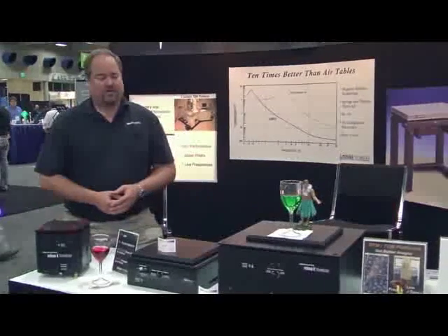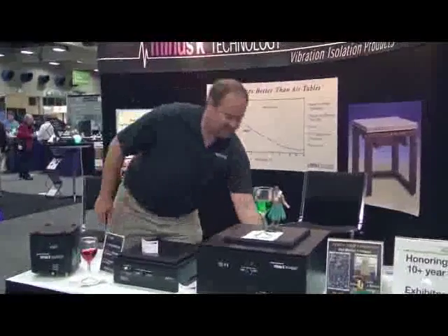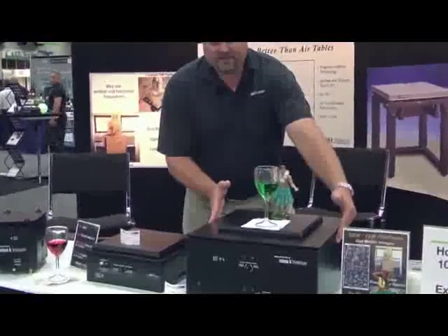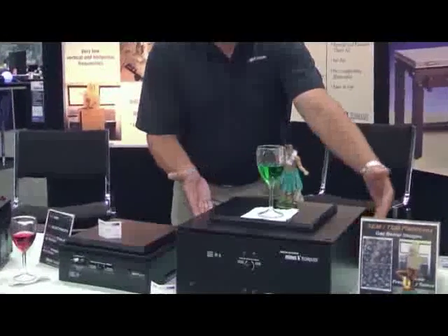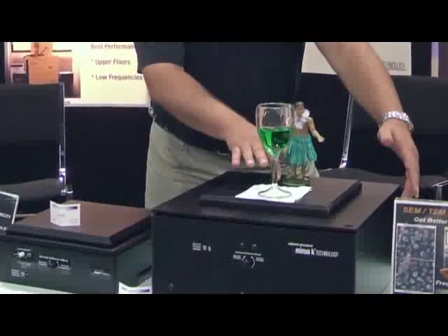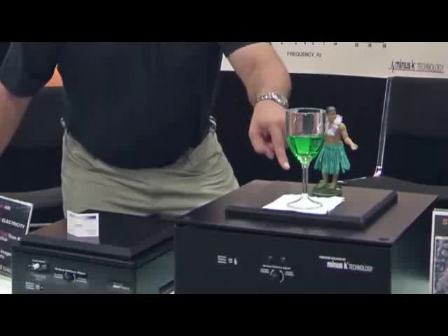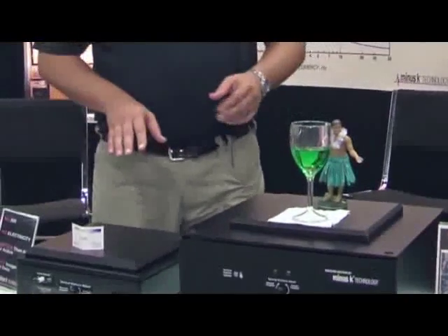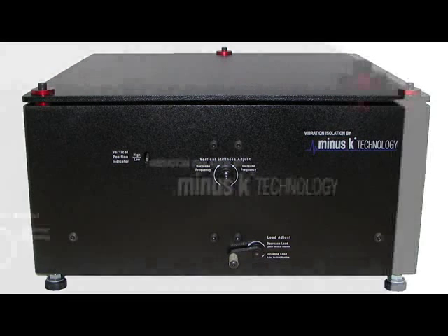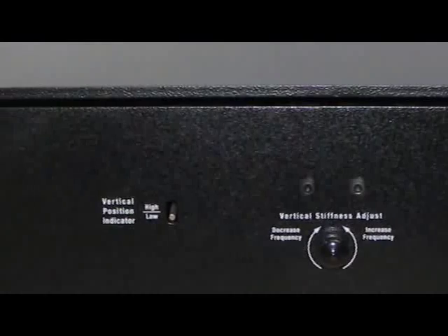This isolator is our BM-4. It has a half hertz vertically and horizontally. For those of you that don't really understand what half hertz really means, I will demonstrate. When I move this table horizontally, you can see it oscillates very, very slowly. That's the horizontal, and then vertically it does the same thing — it's very, very low frequency. What that means is that the higher the frequency of excitation, when I shake this table, this doesn't want to move. That same thing happens in your laboratory. You have an AFM, someone slams the door three labs down, you see a spike in your image, your data is ruined. With this, those spikes are basically attenuated out, so you get very, very good performance and you don't have to worry about problems like that.